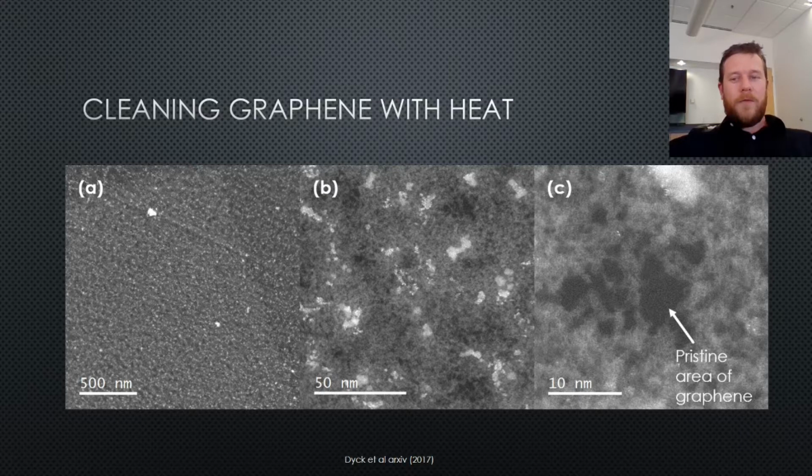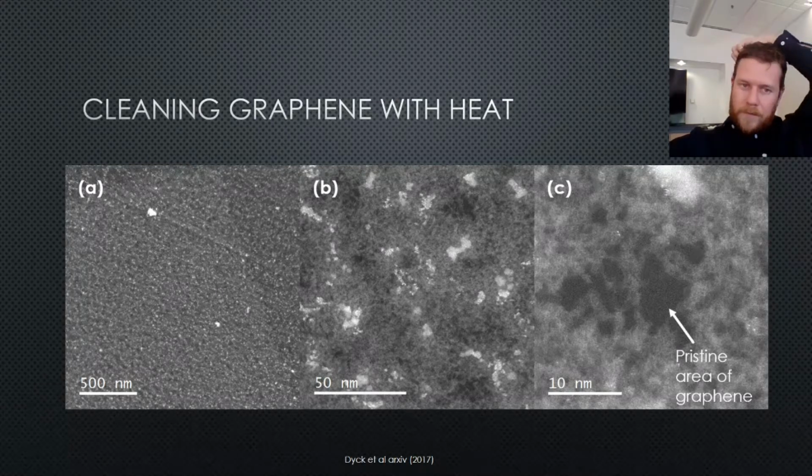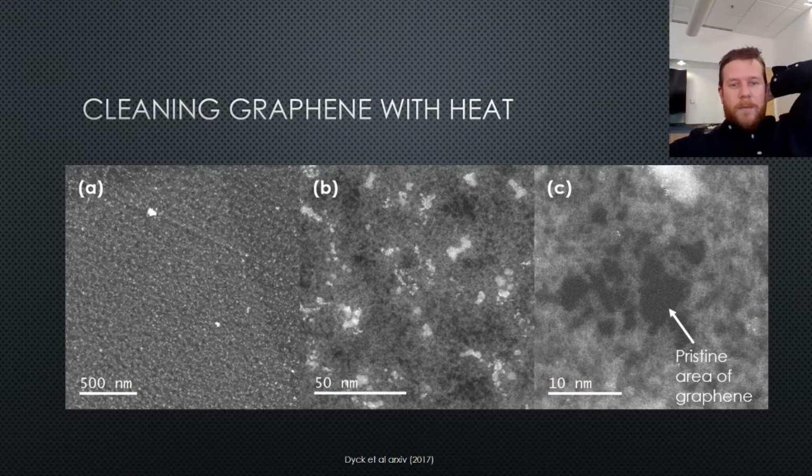Regarding cleaning graphene. So if we're going to make devices out of graphene, it needs to be cleaned. Graphene is notoriously filthy. So this is a clean spot of graphene, but zooming out, you can see that mostly it's covered with contamination. And this stuff is really nasty for us microscopists, and so we would really like a way to get it clean. Not just us microscopists. I mean, if you want to pattern things on graphene, most of what's there is not graphene, it's the contamination. So you have to have a way to get rid of this contamination if you want to do something useful with it.